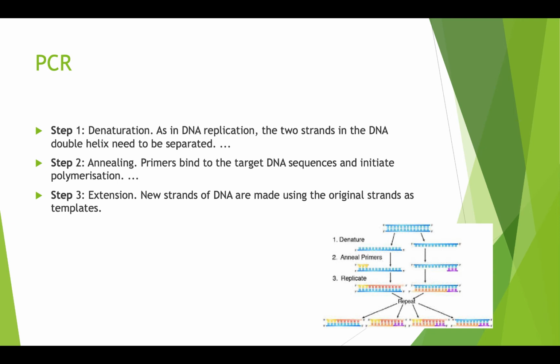So in the first cycle, in every cycle we usually have, at the beginning, a step which is the initial denaturation, where you incubate, and then you start these 3 steps over and over and over. Then sometimes you give it an extra step, a final extension to keep going, and then you cool it down. But the PCR consists of these. Basically this is the chain, this is the repeated cycle, the cycle that we hear about in PCR.